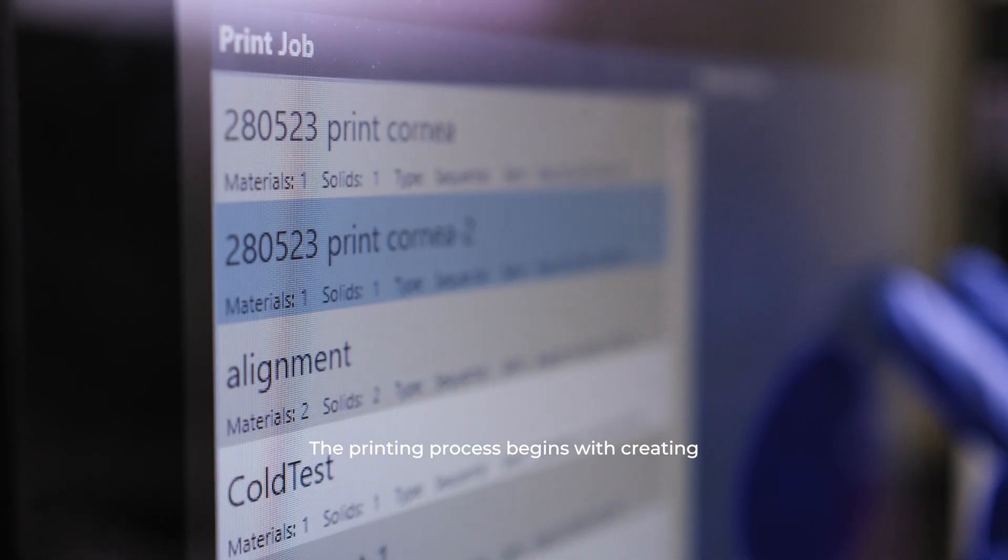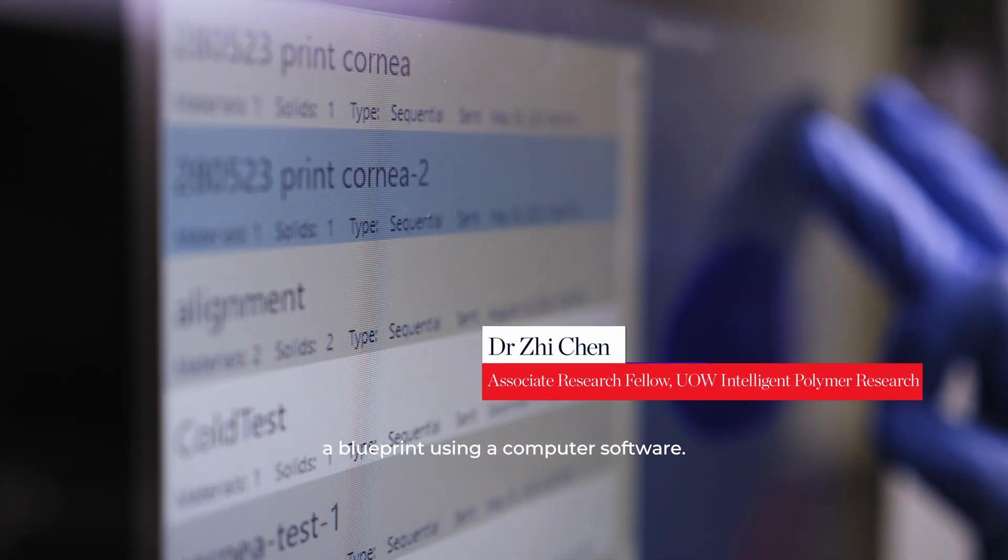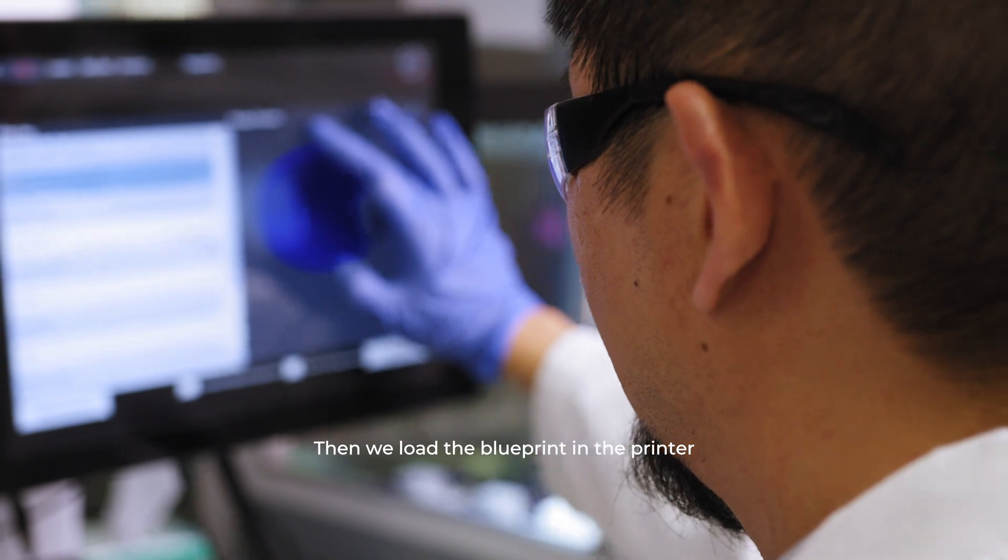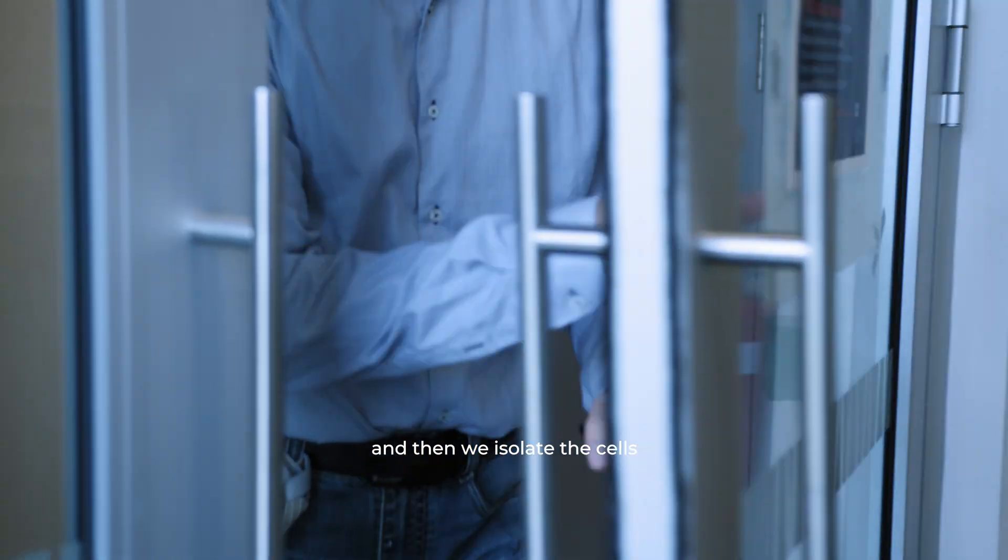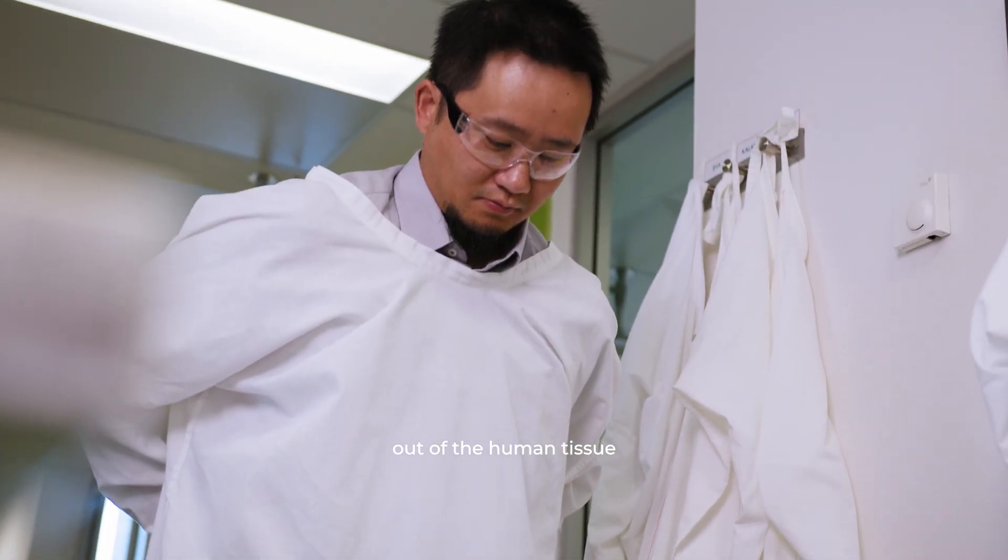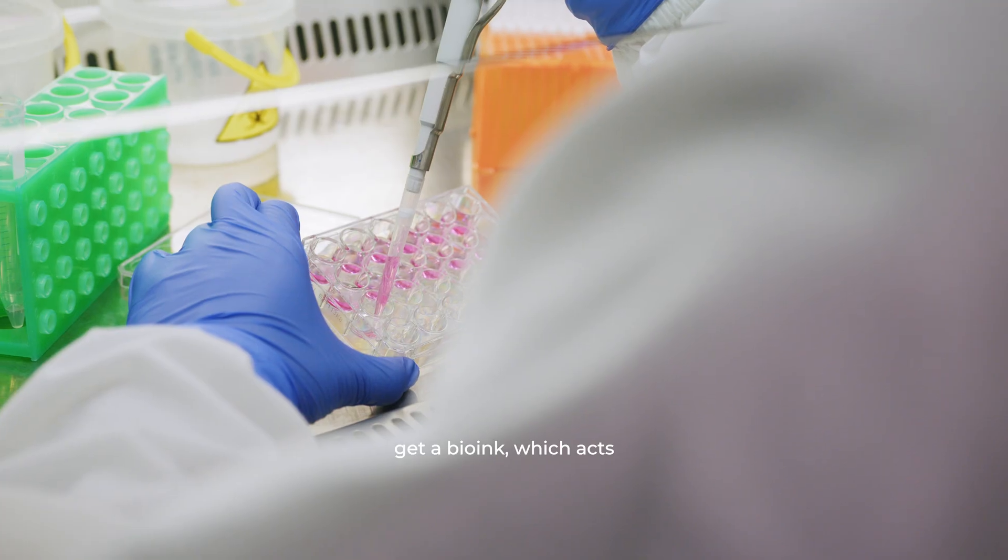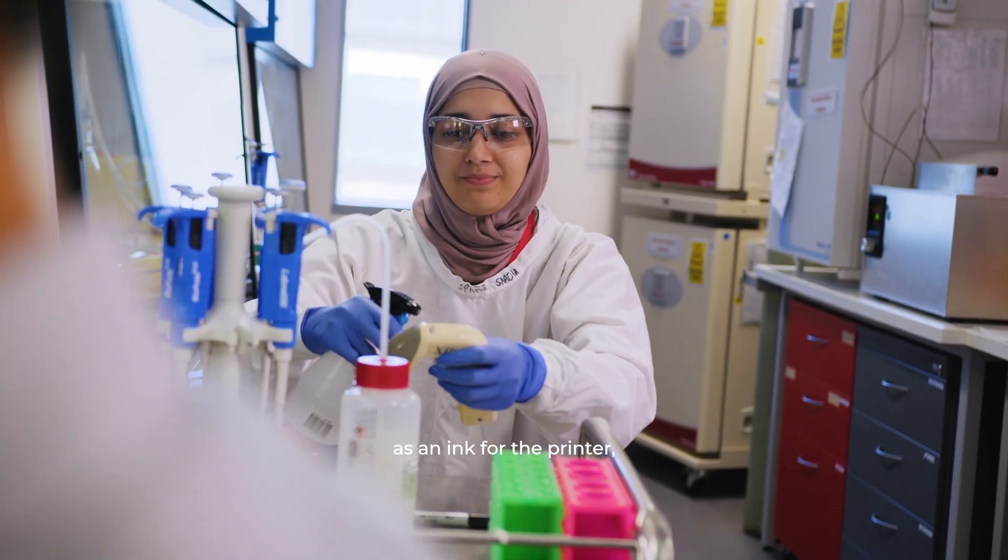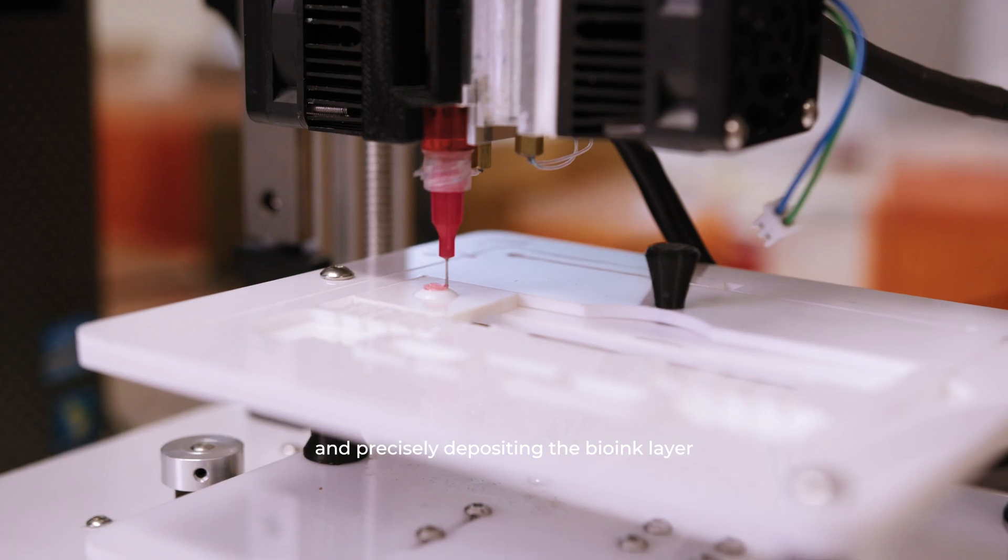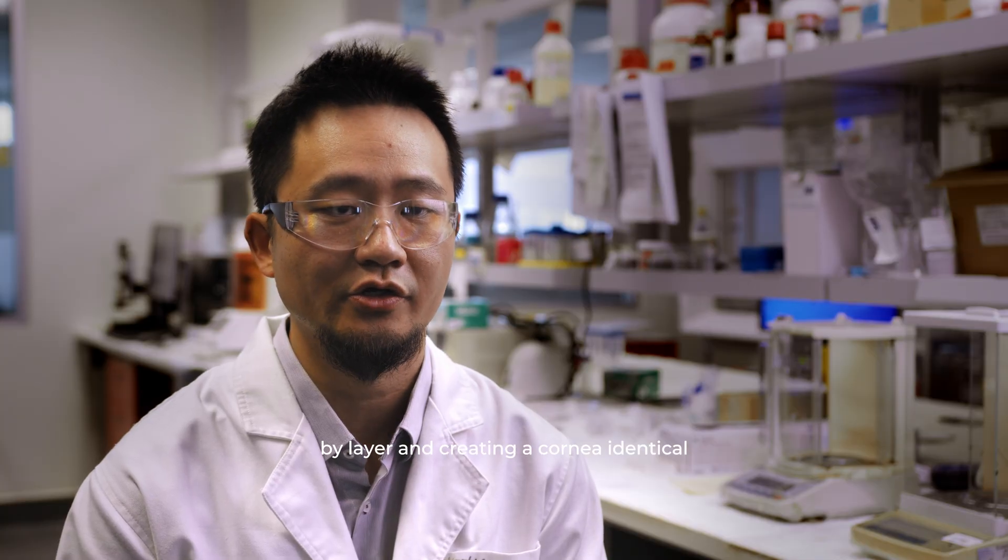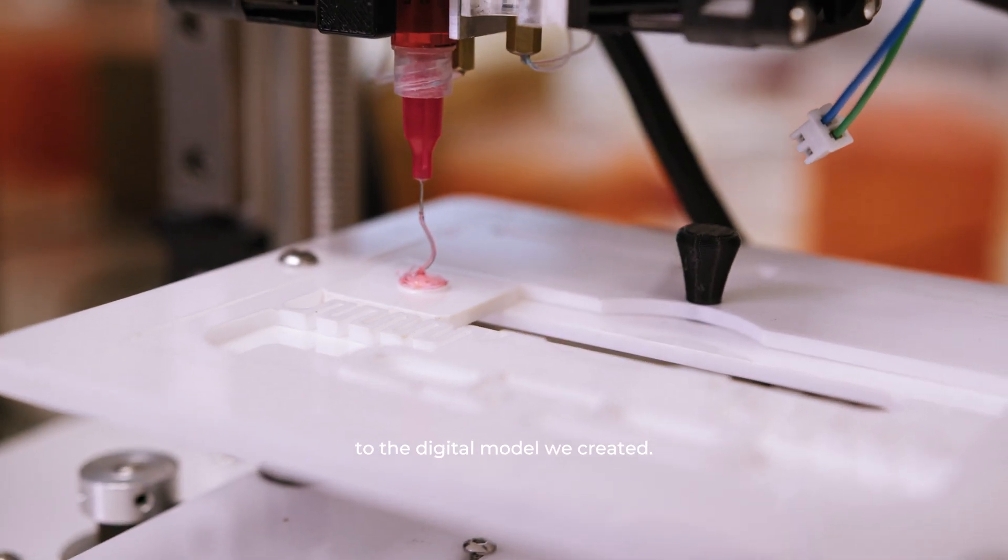The printing process begins with creating a blueprint using a computer software and then we load the blueprint in the printer. Then we isolate the cells out of the human tissue and it combines with our biomaterials to get a bio ink which acts as an ink for the printer, precisely depositing the bio ink layer by layer and creating a cornea identical to the digital model we created.